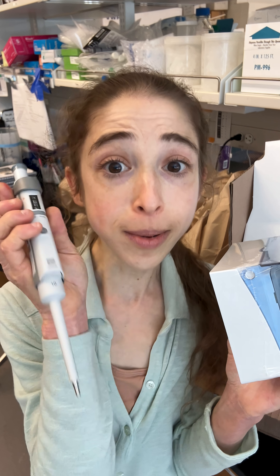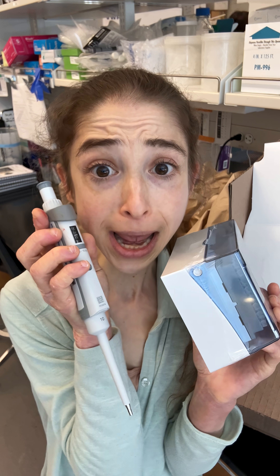P-10! Oh my god, I've been so excited for this. P-10! I'll be right back.